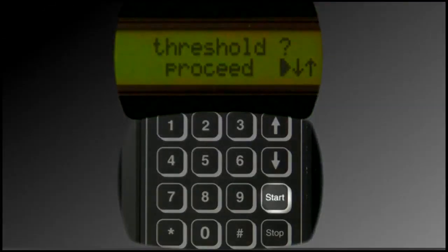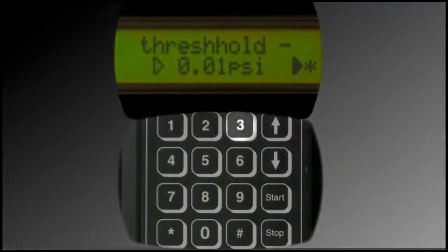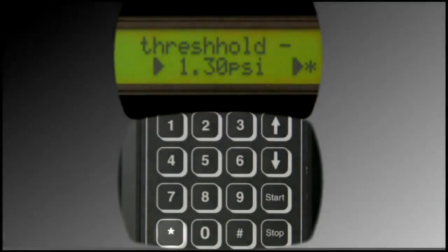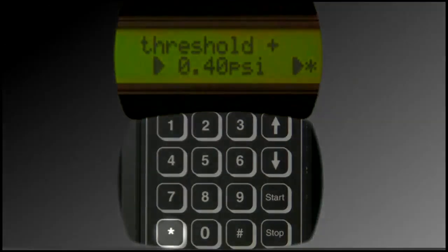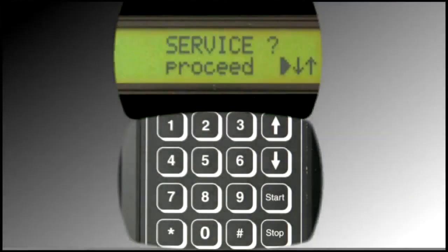Press the Start button to view the current lower pressure threshold. The setting programmed must be between 0.14 and 1.45 PSI. If desired, the lower pressure threshold value can be changed. Numbers move from right to left when entered. To save the value, the Star button must be pressed. This also leads to the next menu, the upper pressure threshold value. As with the lower pressure threshold, the setting programmed must be between 0.14 and 1.45 PSI. A larger pressure threshold setting allows for more tolerance of slight pressure variations during the integrity test. A more narrow pressure threshold setting ensures variation from desired test pressure is minimal. Press the Star button to save any changes made and to return to the main threshold menu. Press the Stop button to return to the main service menu.